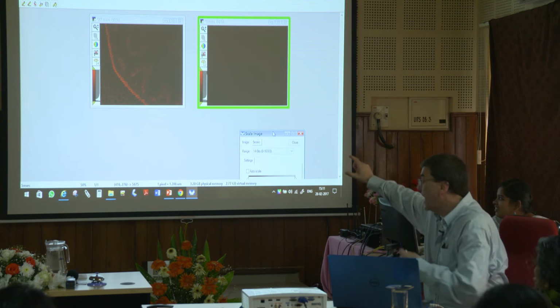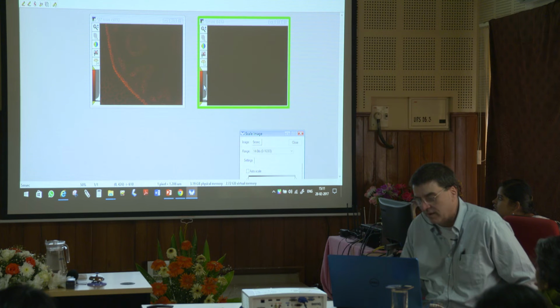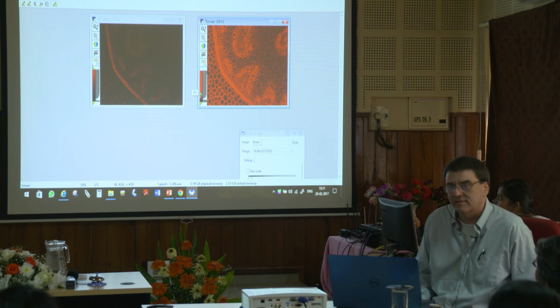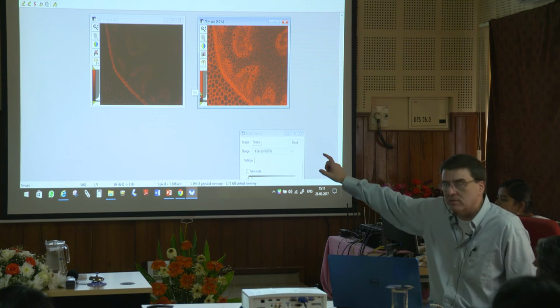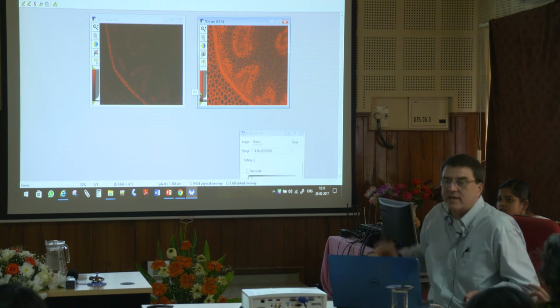This is fair. I have my scaling the same. I have not done this and said, well, hey, wait a second, this image is actually brighter than this one. It's not the truth. I have manipulated how it looks. But when you get into the data of it, the data tells you, hey, it's not what it is.